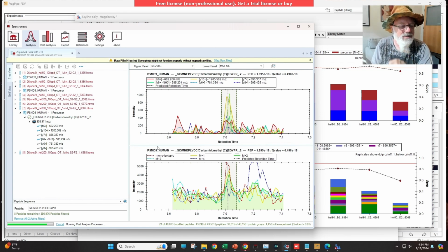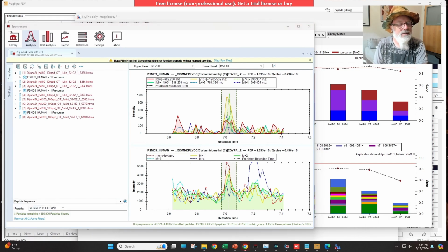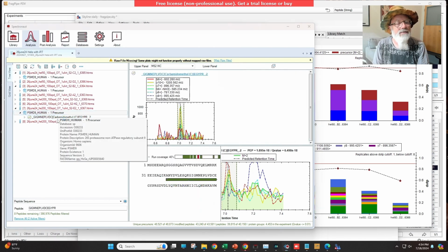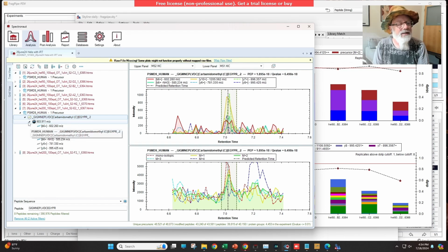This will probably close again, so I'm going to copy this before it disappears. Let's use B6, Y10. And I knew it would disappear, so we're going to go assay, peptide sequence. Go back, there, 6367. Looks exactly the same, I believe. Yes. We can go back to the video to see if it's using the same ones. I don't know. I've already forgotten. Maybe it's not. Let's rewind the video. We can rewind the video and see.